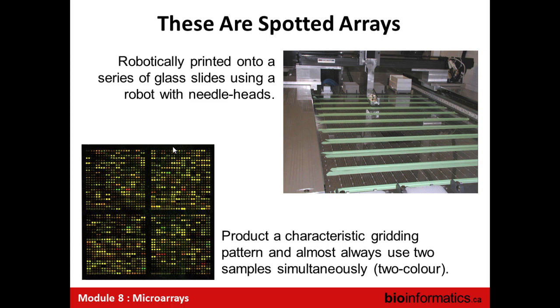You'll have people say, oh, we'll do RNA-seq for you for $175, but they're also producing so little data that a microarray gives better signal. So there's a trade-off level there between how much sequencing you do and how good your results are. But that's inherently one of the advantages of RNA-seq. You can make that trade-off. With a microarray, you can't. You can basically say, this is what I'm going to get for this price, and this is the quality of the data. And eventually, this technology is going to go away for most uses because sequencing allows you that greater flexibility.